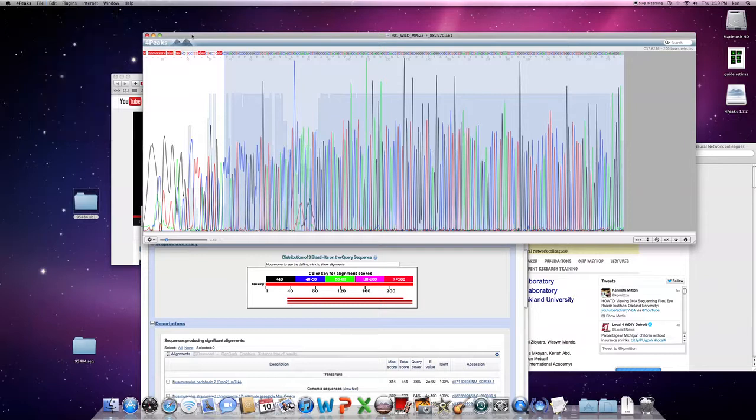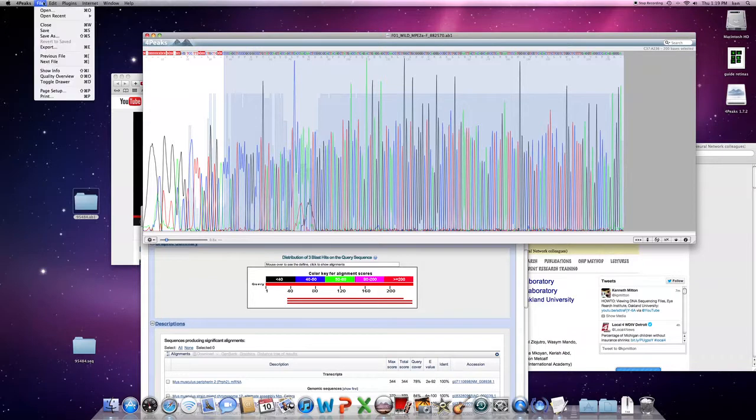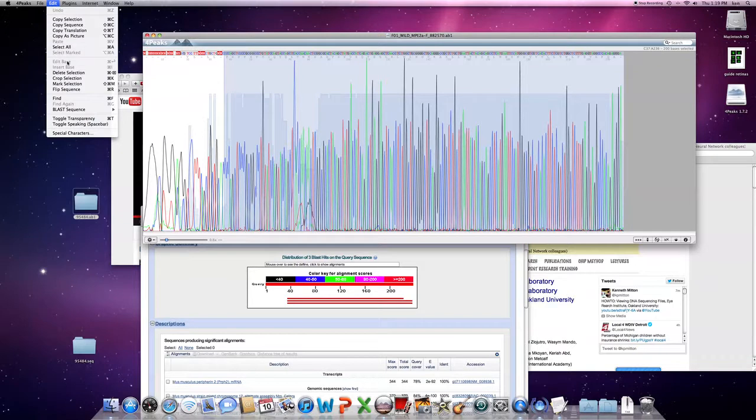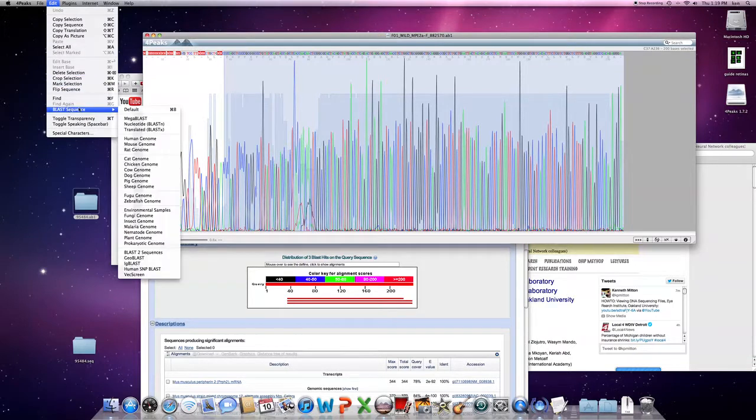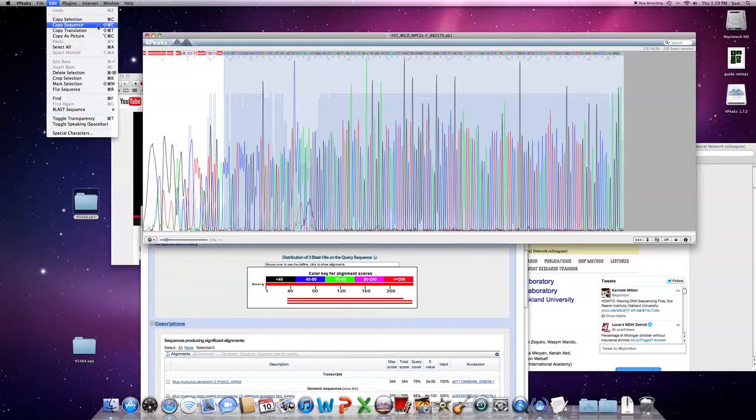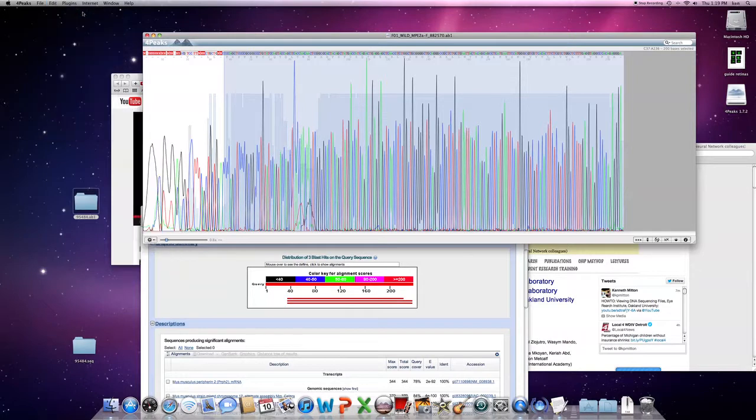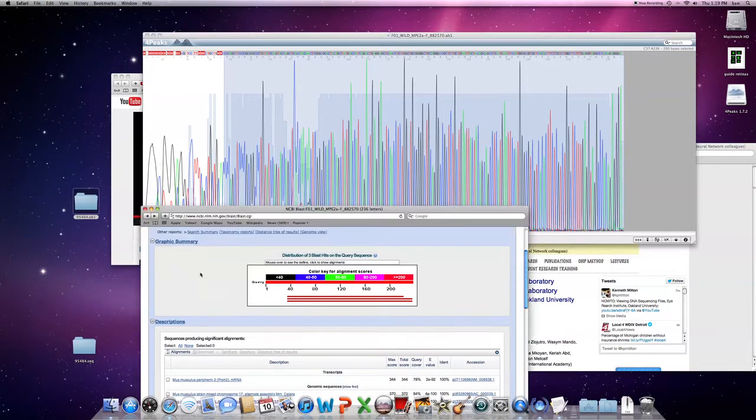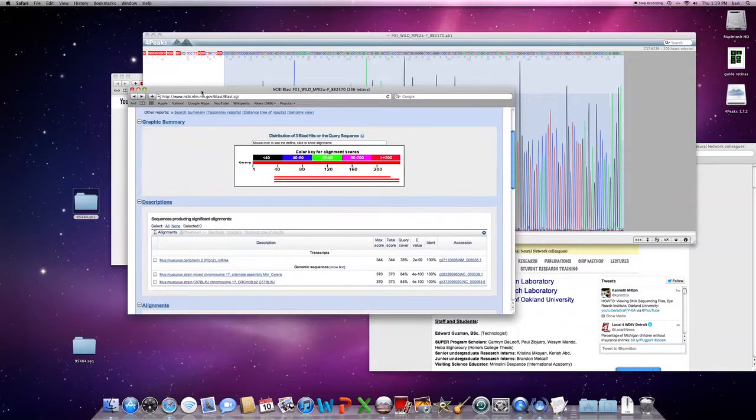And you can test it yourself going on the web, or you can also take your sequence right away and use this 4Peaks software itself to blast the sequence. You can send it to nucleotide blast or the mouse genome and basically send it off. It will launch your web browser and put the job in for you.